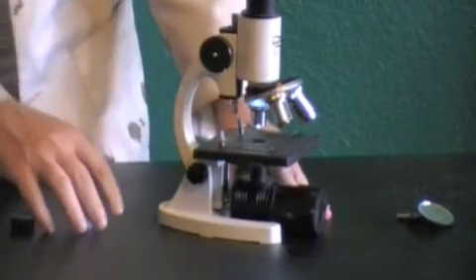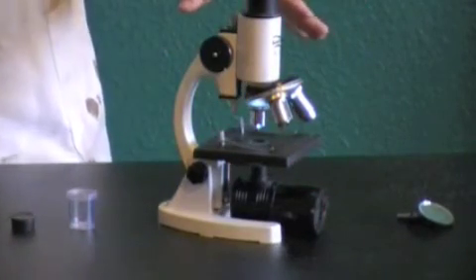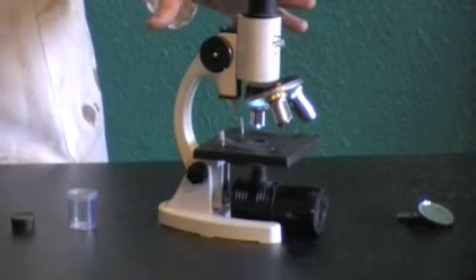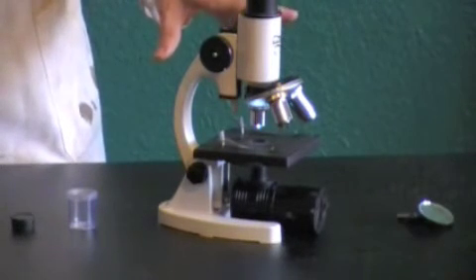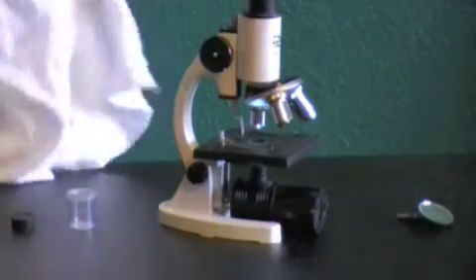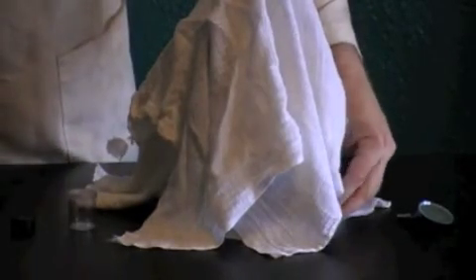And anytime you're not using your microscope, keep it covered. You should have a microscope cover, some kind of plastic cover that you can put over it. That should have come with your microscope. However, if it didn't, just have a towel or some other thing that you can put over the top of it while you're storing it, without the light on. That just keeps dust out of your lenses. So there you go. There's your microscope. You're going to have fun with this.